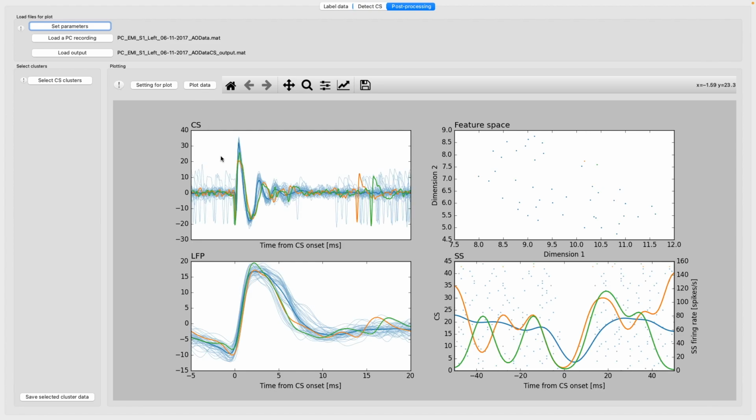So what you see here is very nice. All complex spikes that are detected are shown here. First of all, there were 3 clusters that were detected. There's one green dot here and one orange or yellowish dot, and the rest are blue dots. So these are all the complex spikes that were detected in your data set in this case. And the average action potential trace of these 3 complex spikes are seen here.